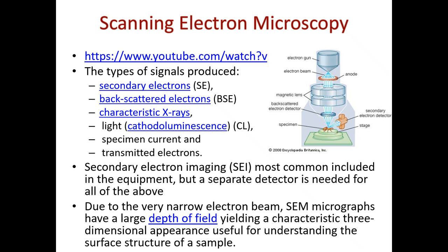So this is very common. If I have a porous medium, electrons will go somewhat deeper into the pore spaces. But it is also harder to say what is precisely in this top plane of the image. There will be some of the information from the depth that gives a little texture to the image. We'll look at some of these things.